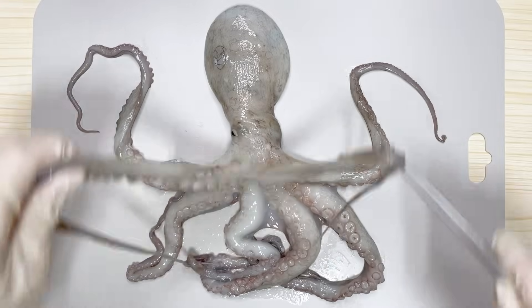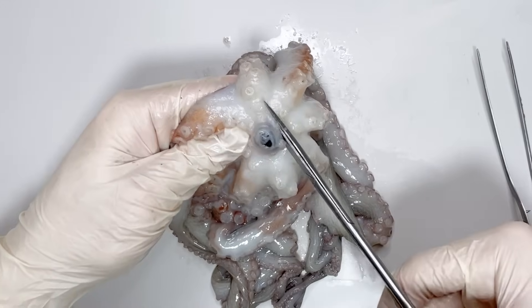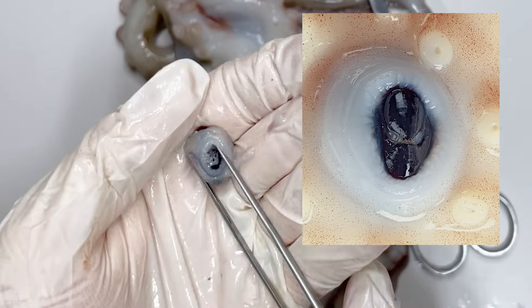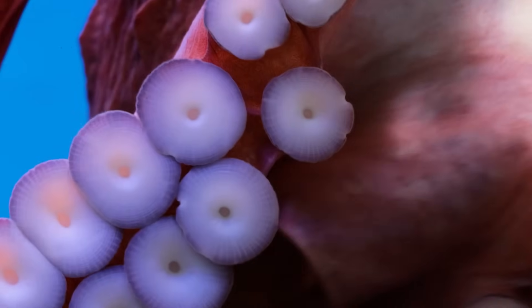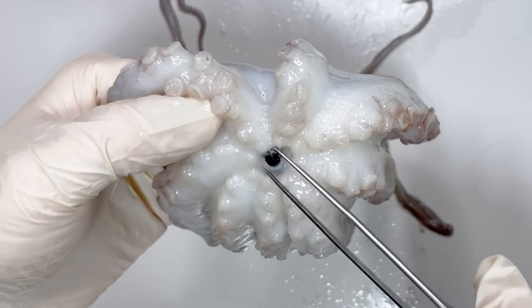The true mouth of an octopus is located in the middle of its arms. If you were to dissect around the mouth, you would find a beak-like structure. Octopuses catch their prey using the suckers on their arms and then consume it using the beak located at the center of their arms.